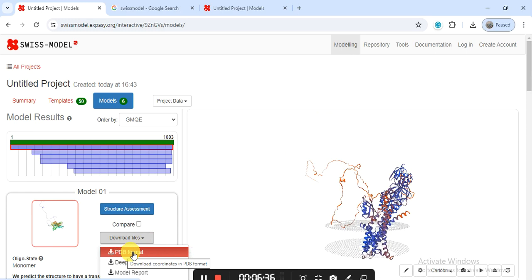Or if you are doing the docking, you can take this PDB file and using PyMOL or any other docking software, for the docking you can use it.